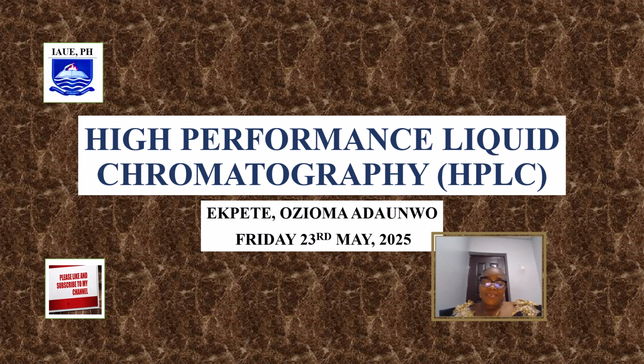Ekpete. Today we will be considering high performance liquid chromatography with the acronym HPLC. The acronym HPLC stands for High Performance Liquid Chromatography or High Pressure Liquid Chromatography. Chromatography is a separation technique. Chromatogram is the chromatography result, and chromatograph is the chromatography apparatus.